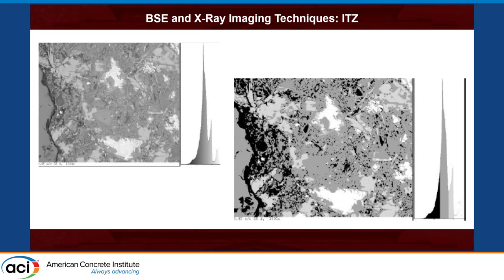For backscatter imaging, the gray level must be optimized for quantification. On the left side the gray level is not optimized; on the right side it is optimized. You can then characterize the ITZ by adding nanotechnology materials such as fine powders and fly ash. This is a great technique to understand the mechanism and justify how microstructure relates to measured properties such as resistivity and transport properties.